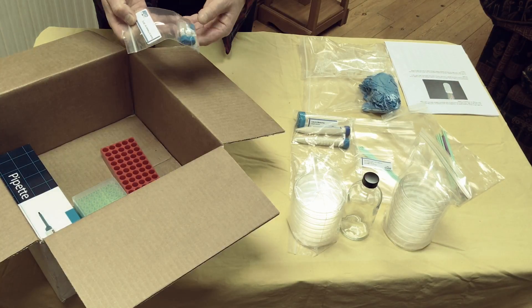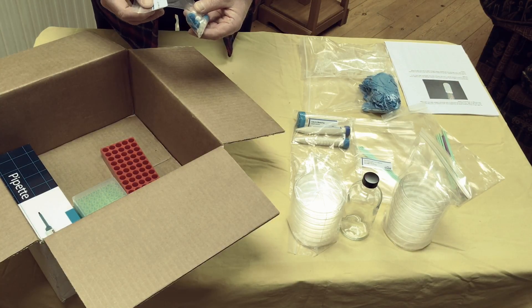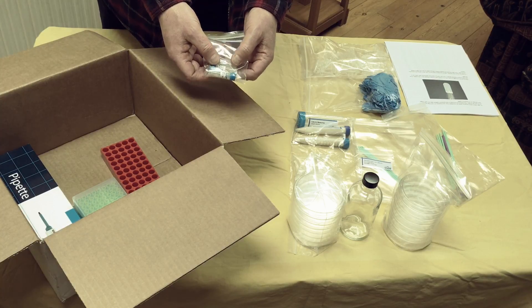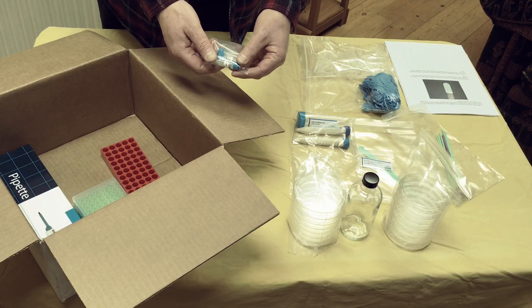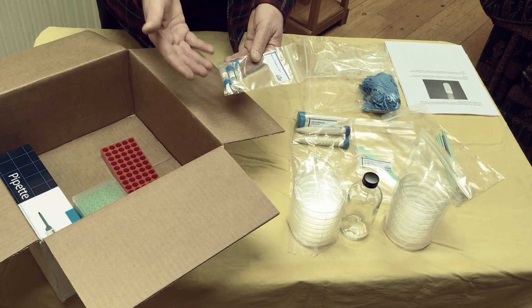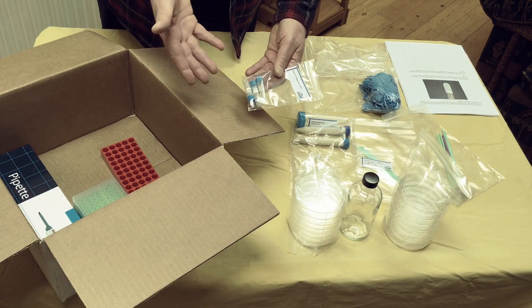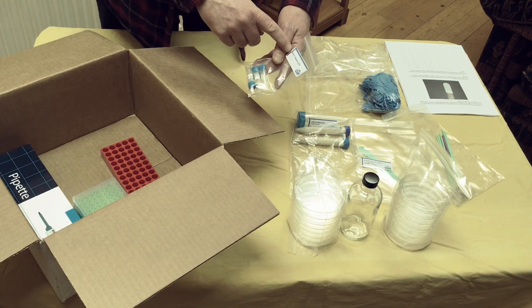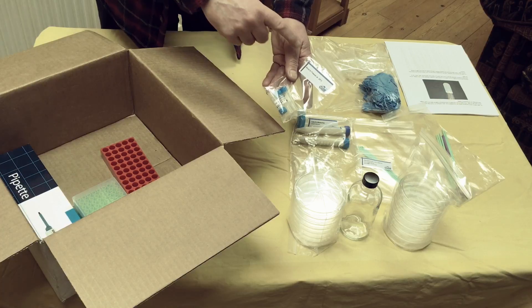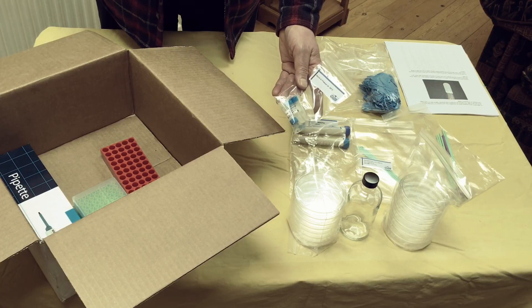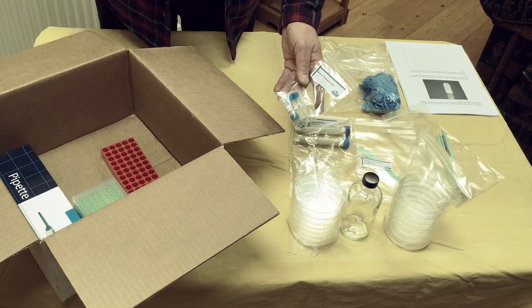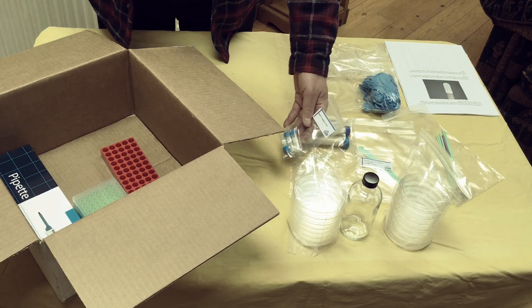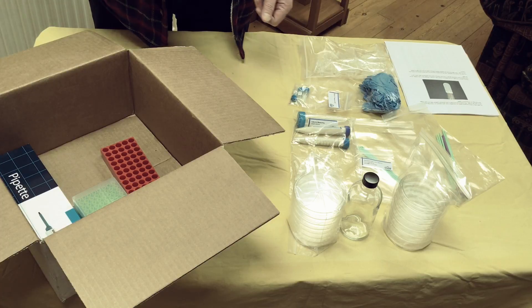And then what have we got here? This says bacterial Cas9. I think these are the biochemical substances that are necessary for doing the DNA editing. It says store in freezer at minus 20 degrees C, which is a bit worrying because these have been in transport. So they haven't been stored in a freezer. I'll have to look up what that's all about.